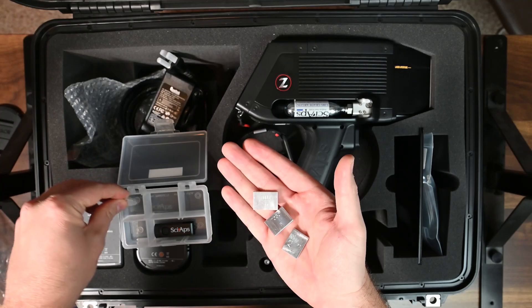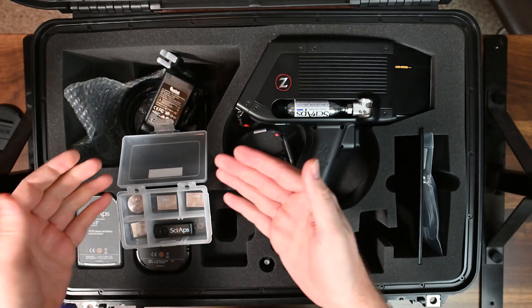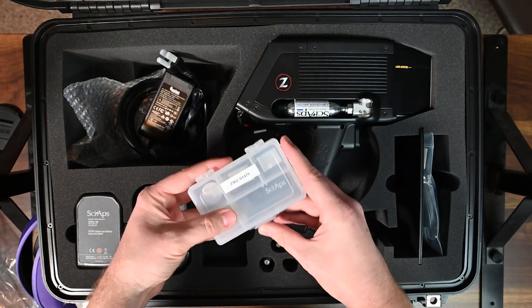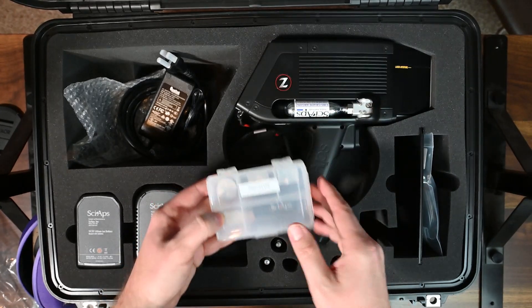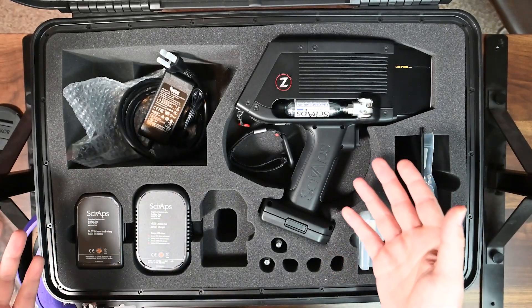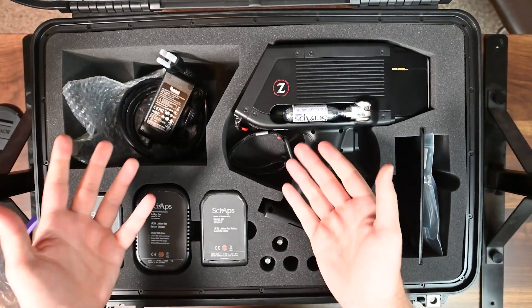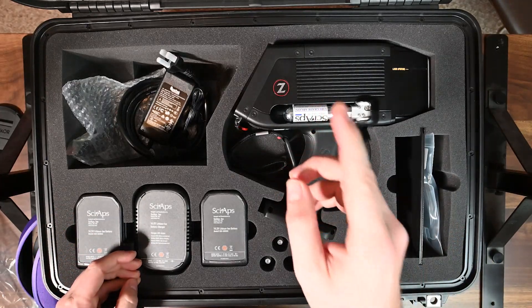We have a 6061, a 3003, a 7050, and an A356 aluminum sample. These samples will be unique to your analyzer. This is an aluminum-only analyzer, meaning it's only designed and calibrated to analyze aluminum. Each one of these samples calibrates the intensity to give you better data for specific elements. When you run intensity calibrations you'll need to run all of them — and it's great that they just come right there in the box.